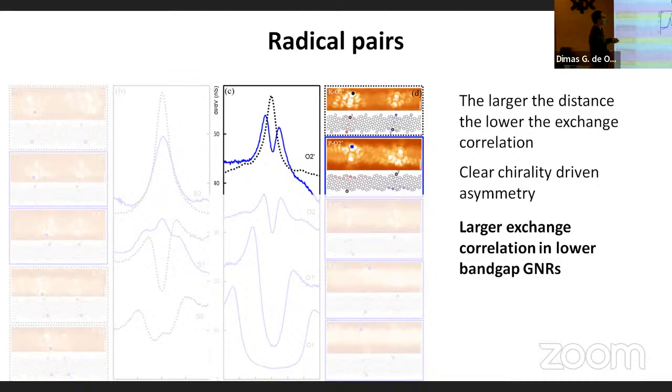In this case, we just see a Kondo peak. That's basically these 2 spins, they are independent of one another. They don't really talk to each other.